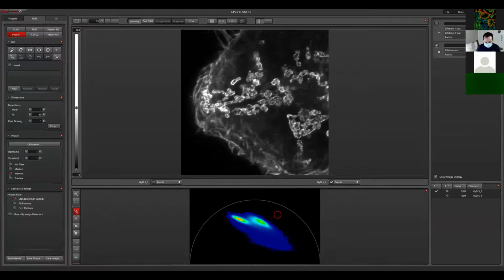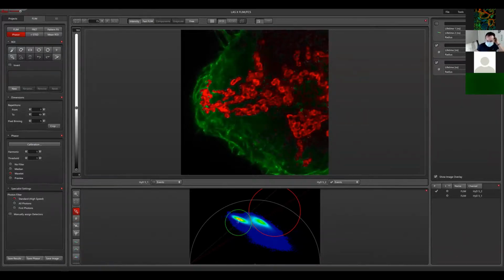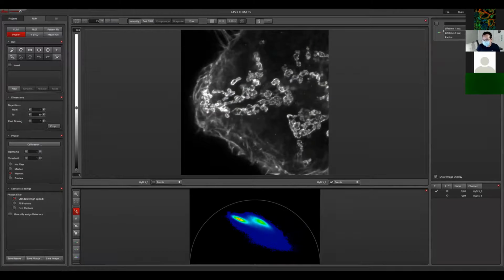Either the solution that I told you, where you can just do the circle and then you more or less select your area, which as it is is not the best one, but it's one that works pretty fine. You can see here, I'll say it's not so bad looking. Or what you can do is use another tool, because why use lines when we can use triangles?